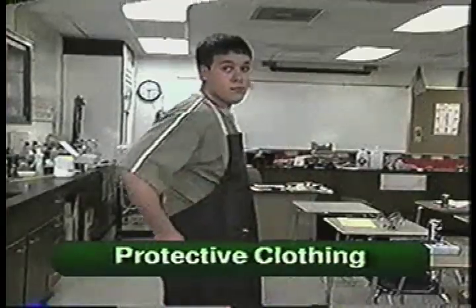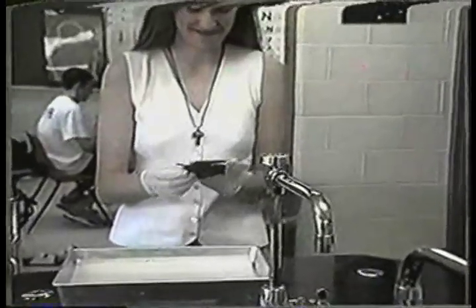Be sure they are on securely. Nothing says I'm a real scientist like gloves.